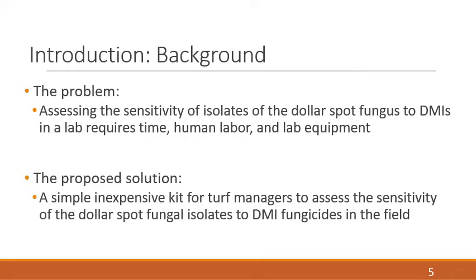We arrive at the problem we seek to address with this project. Normally, assessing the sensitivity of a fungal isolate to a fungicide requires time and human labor. We are seeking to reduce these, along with the technical requirements for such tests. A simple field kit would allow turf managers to sample leaf blades displaying symptoms of dollar spot and assess the level of resistance of the fungus to a fungicide.